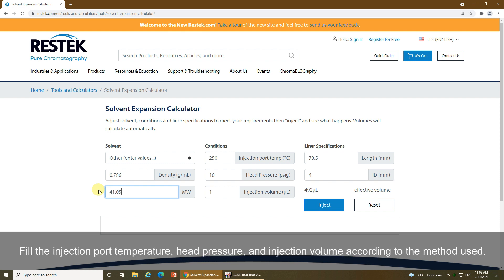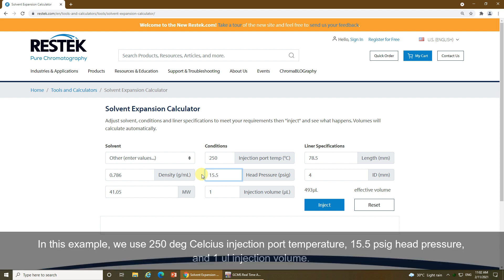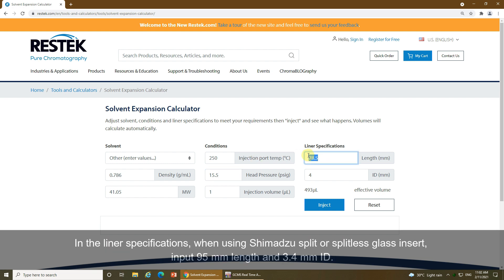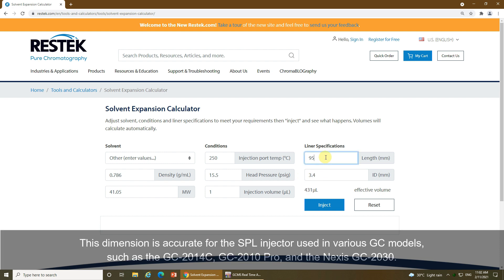Fill in the injection port temperature, head pressure, and injection volume according to the method used. In this example, we use 250°C injection port temperature, 15.5 PSIG head pressure, and 1 microliter injection volume. In the liner specifications, when using Shimadzu split or splitless glass insert, input 95 mm length and 3.4 mm ID. This dimension is accurate for the SPL injector used in various GC models such as the GC2014C, GC2010 Pro, and the Nexis GC-2030.